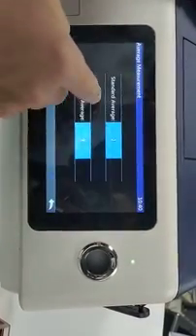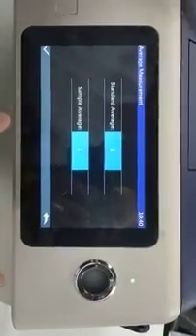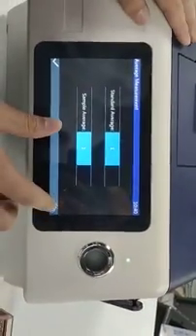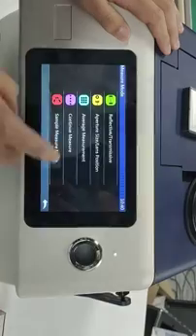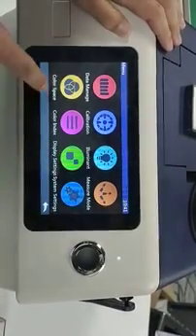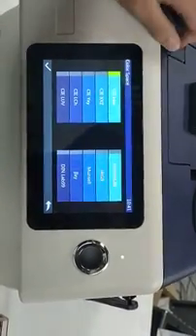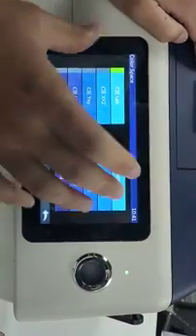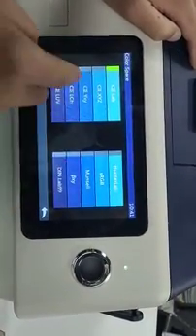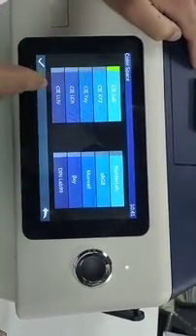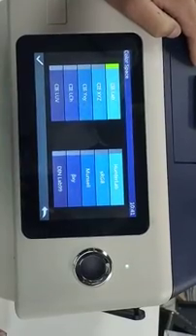Average measurement is a measurement mode. How many times you measure a sample? Ok, other measurement modes. Color space. We have this kind of color spaces here. You can choose according to the requirement.